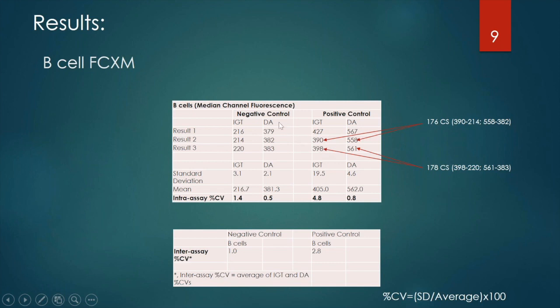So what I'm trying to show you is although the MCF values are higher with your DSL method, the channel shifts are similar. So the increase is constant. So maybe if you titrate it further, and if you are suspecting, in your case, higher background with your goat anti-human IgG concentration, you need to titrate it further. Maybe that would bring down your MCF values. So you need to clearly check what concentration will suit your protocol.